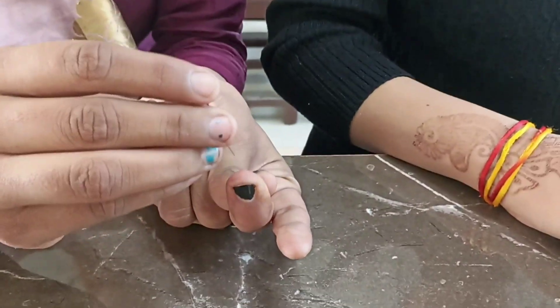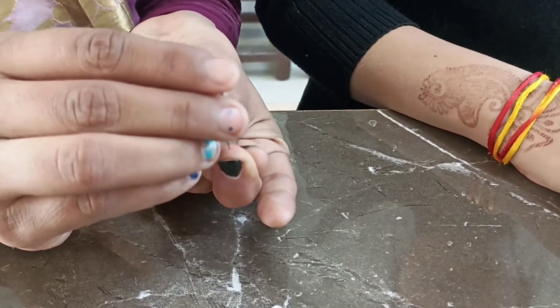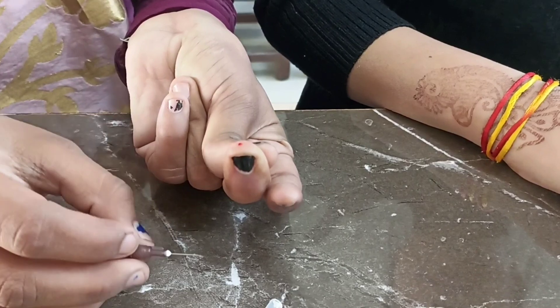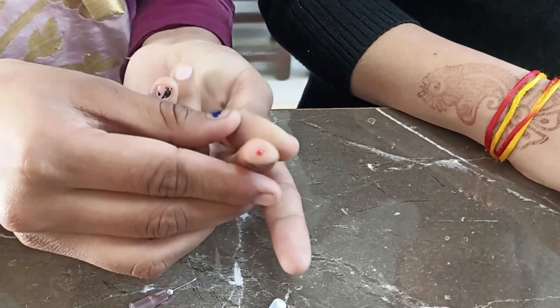Prick the finger with the pricking needle. Take the oozing blood out.